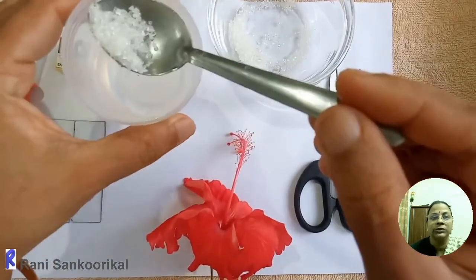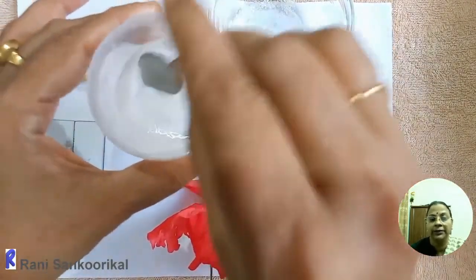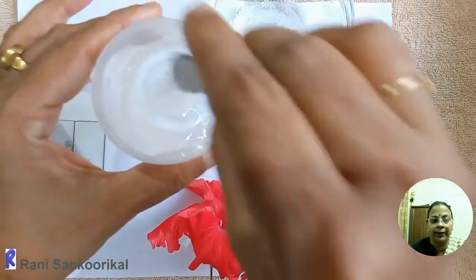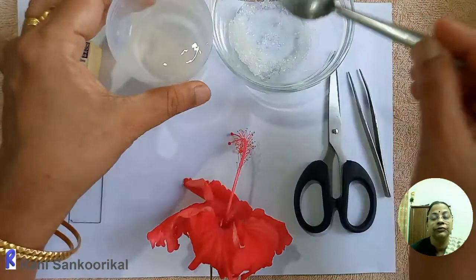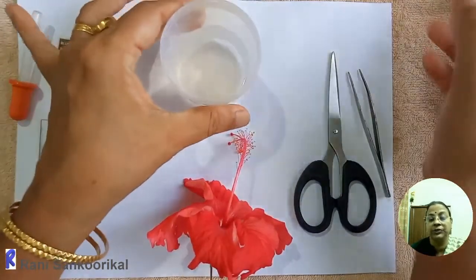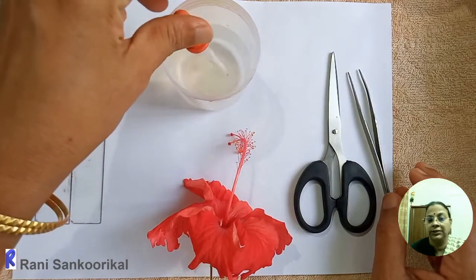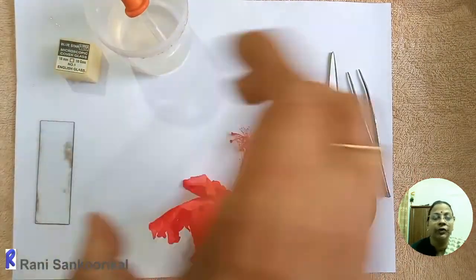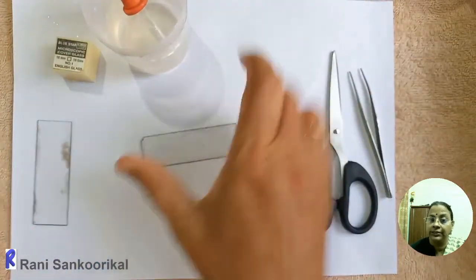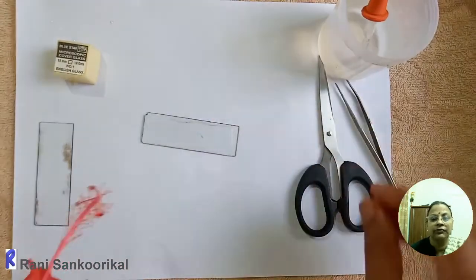So approximately 10 gram of sugar in 100 ml we have to add and stir it well. Thoroughly we have to stir, and if you have boric acid, a pinch of boric acid can also be added to fasten the pollen germination, because it is the mineral which is essential for the germination of pollen. Now take the flower.